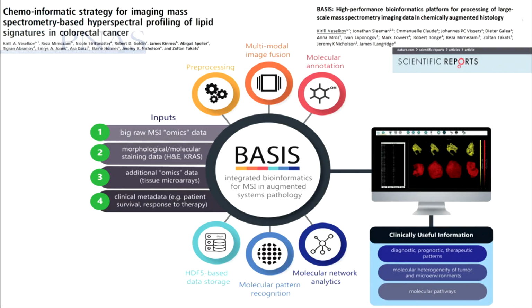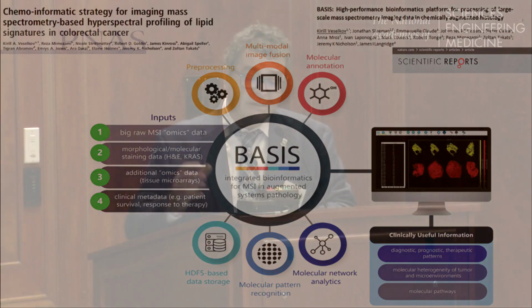This is the basis, and you can see it is a combination. You can have the omics data and additional data, and essentially you put everything in there. I don't have the time to go over that, but we're working on expanding this into tissue imaging, and we're trying to bring this down to the single-cell level. But at this point, we're just doing it at the tissue level.